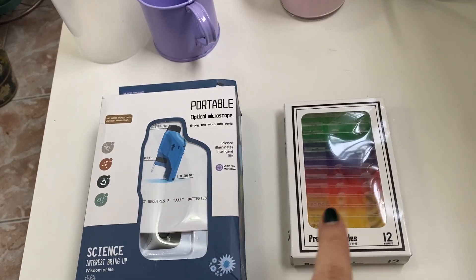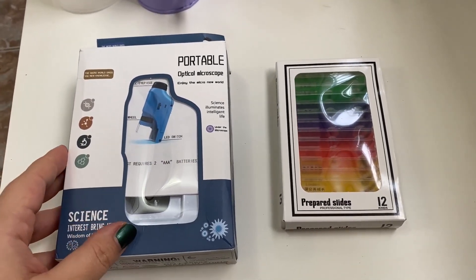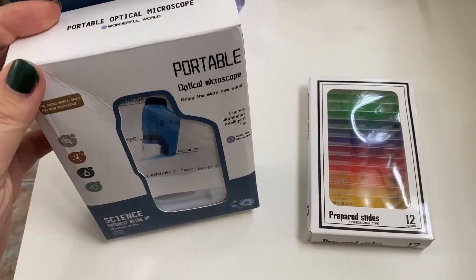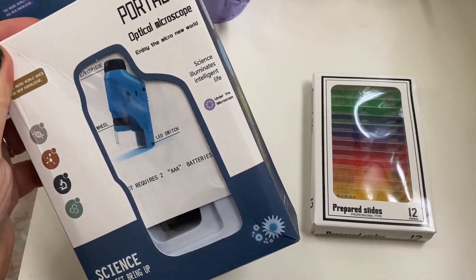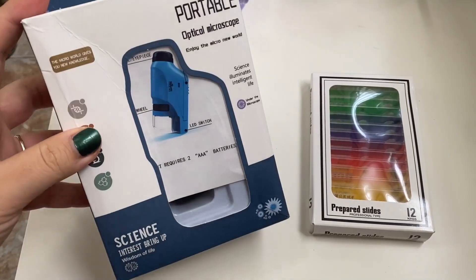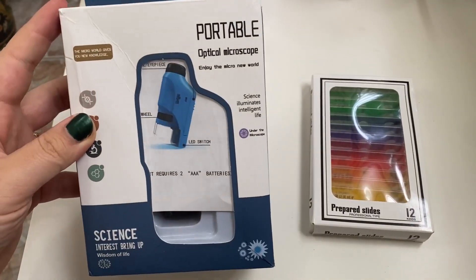Both of them came together for the price of $17. On the AliExpress listing it says that the magnification of this microscope is between 60 and 120 times, so let's see if that is true.